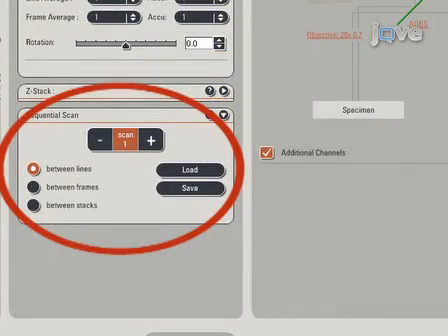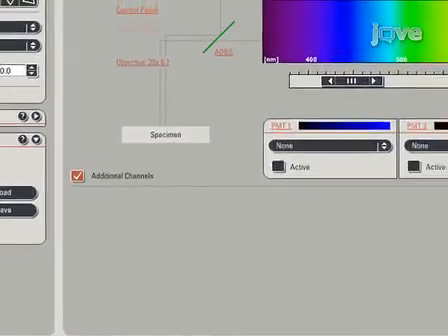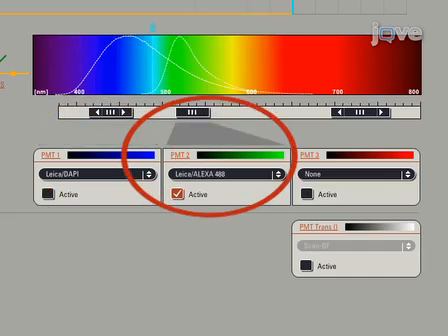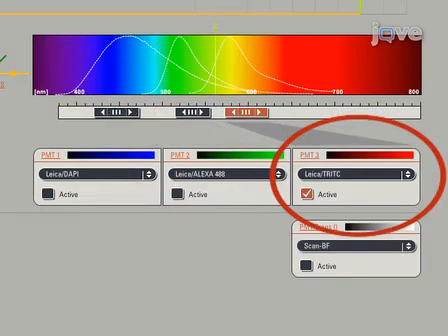Set up sequential scanning settings. Click in the Sec function and then select Between Lines. Select laser beams according to the fluorochromes conjugated to the secondary antibodies: 405 nanometers for DAPI, 488 nanometers for Alexafluor 488, and 561 nanometers for TRITC. Activate photomultiplier tube 1, 2, and 3 respectively.